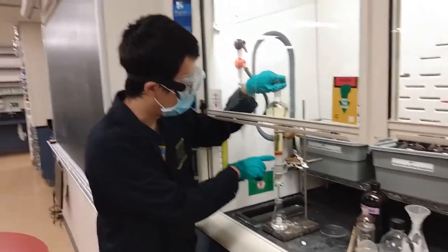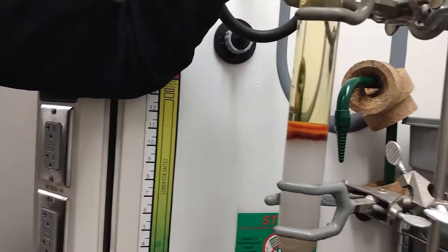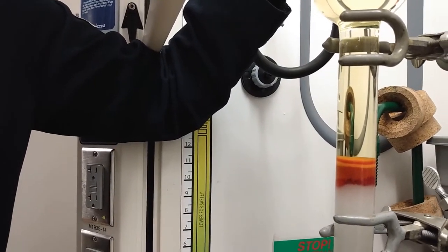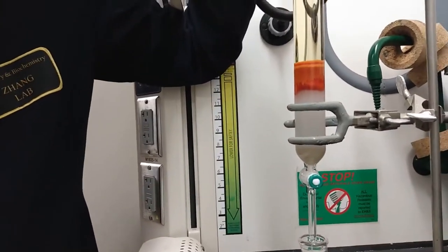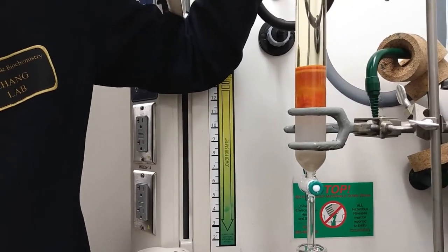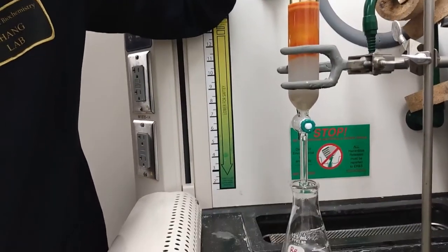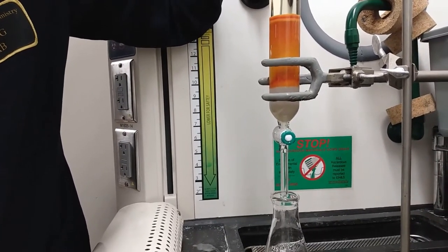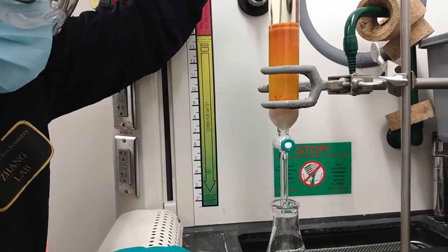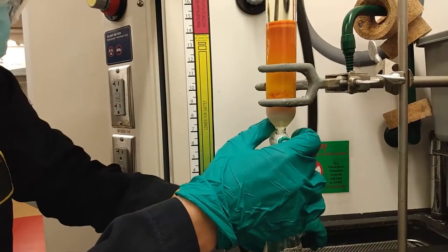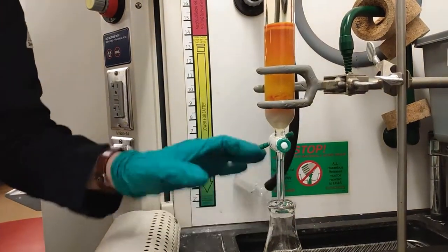We can see a red band starting to elute out. Now it's reached the bottom of the silica pad. Stop pushing right here and switch the container at the bottom.